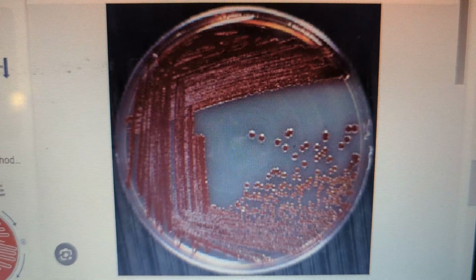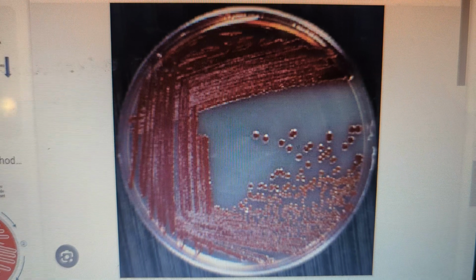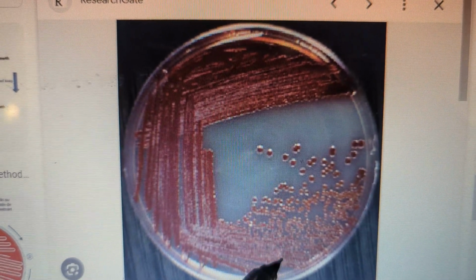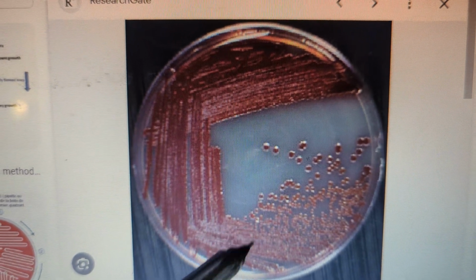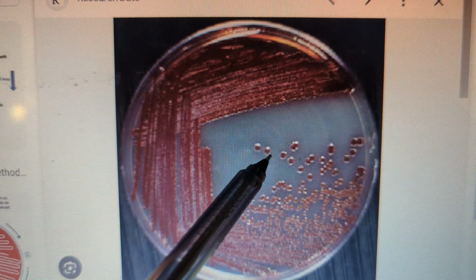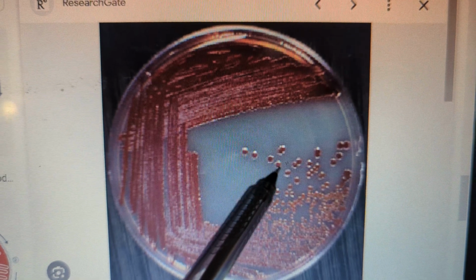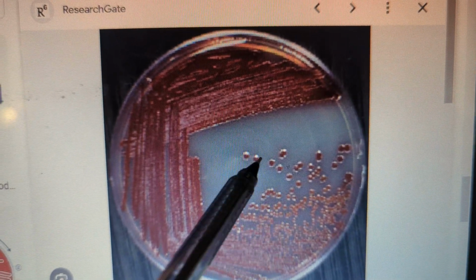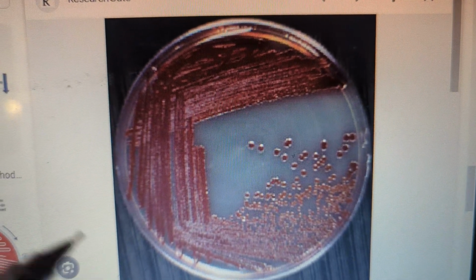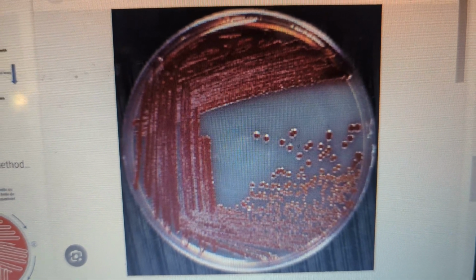Okay. Another characteristic could be cohesiveness. Okay, so this is where we say mucoid, non-mucoid. I'm not quite sure if we can comment given a picture. Really, it's not a good exercise. Okay. And then also texture, where we're looking at the surface of the colonies. Are they dry? Are they smooth? And so on.